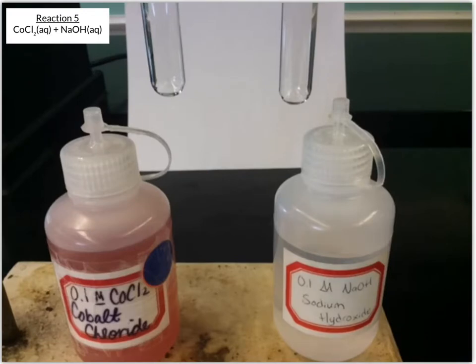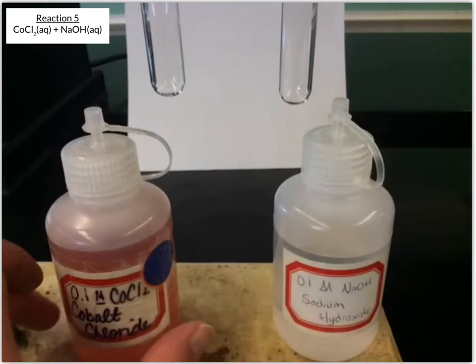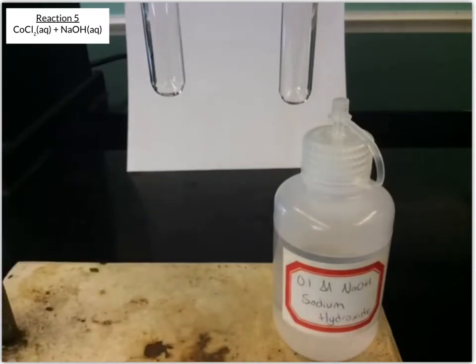Okay, reaction number 5. We're going to take a solution of cobalt 2 chloride and combine it with a solution of sodium hydroxide. So that's cobalt 2 chloride and sodium hydroxide. Again, about 1 milliliter of each.